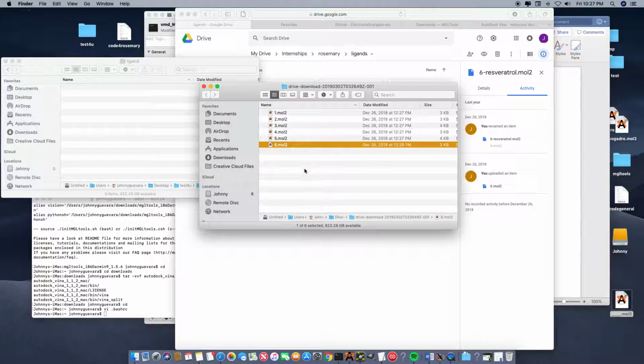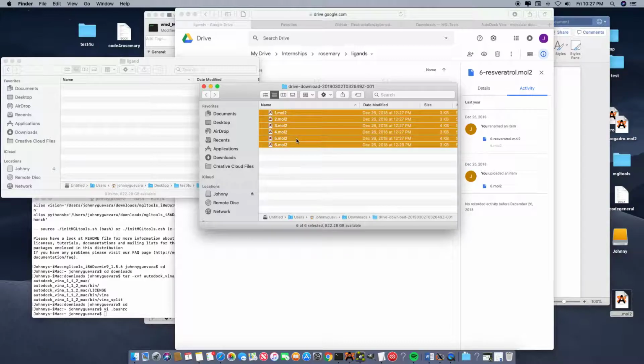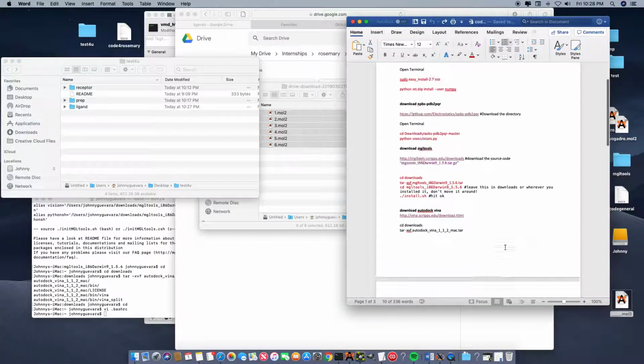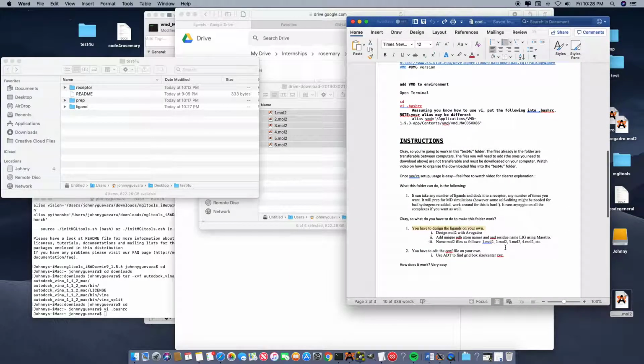So make sure you know which residue is which if you really want to remember. So I'm going to go ahead and copy this here. Now I can include as many residues as I want, 100, 200, whatever. Of course that will take a while, but it is possible.